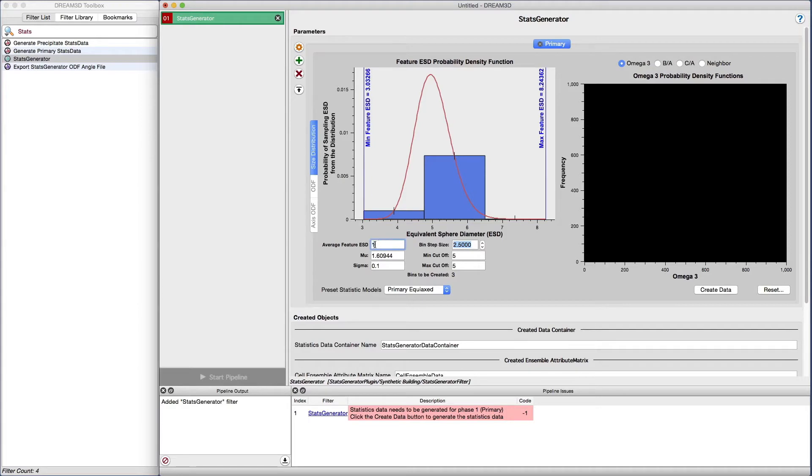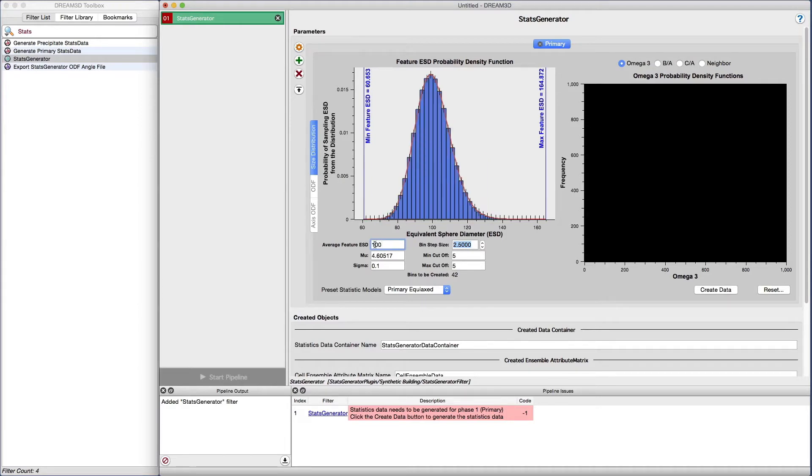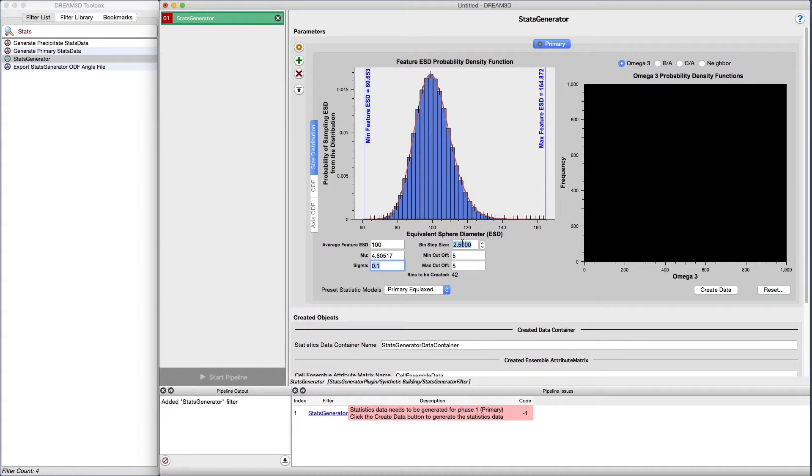For now, we're going to leave the sigma value set at 0.1. Now that we have changed the default ESD, we need to correct the number of bins that are going to be used.